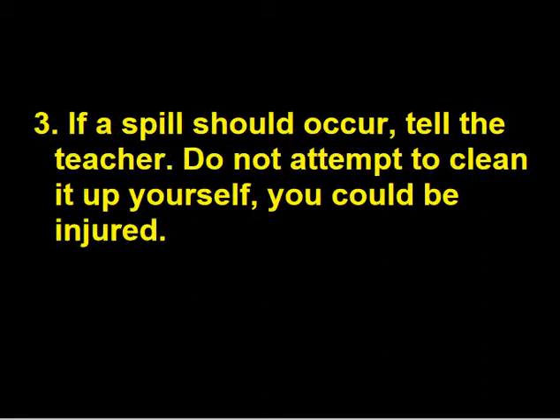If a spill should occur, let me know. Do not attempt to clean it up yourself. You could be injured. That's if it's a strong acid, not a spill of water, but an acid spill. We'll neutralize it, we'll take care of it, and we'll get it cleaned up.